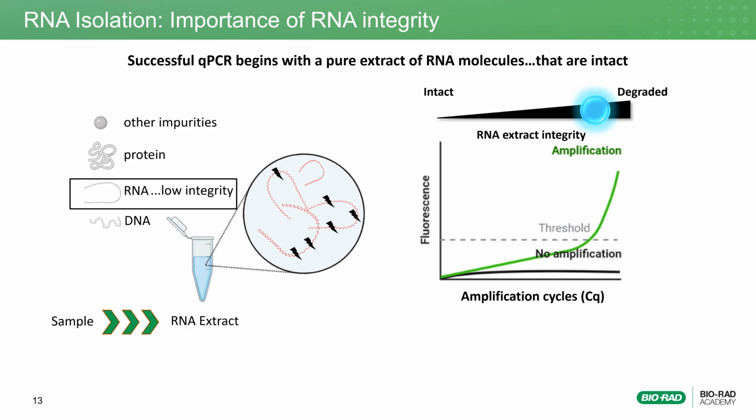Now that you understand the importance of pure and intact RNA extract when utilizing RT-qPCR, let's consider how these variables may be useful in considering the appropriate extraction kit and sample type, and explore the precautions necessary for your experimental needs.